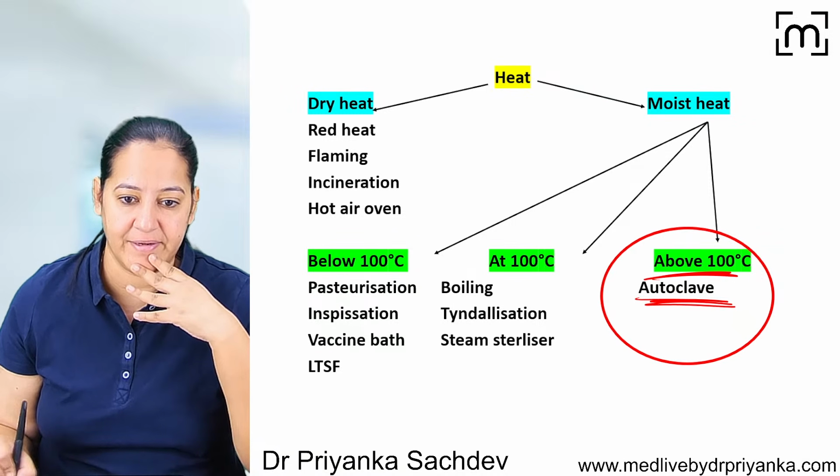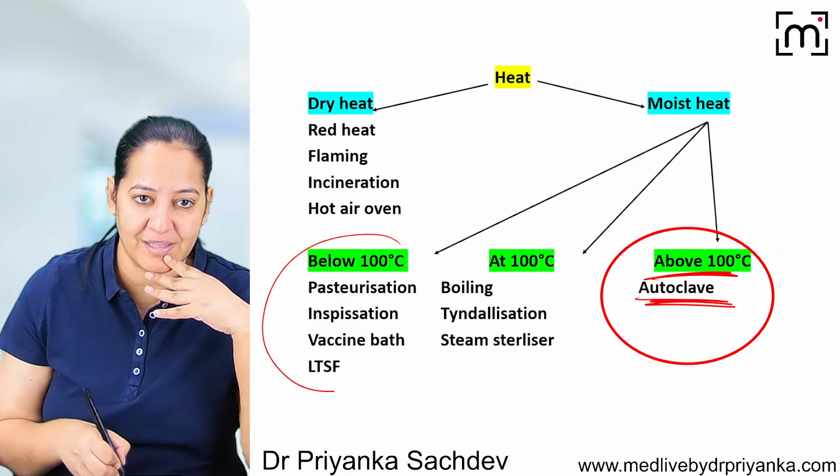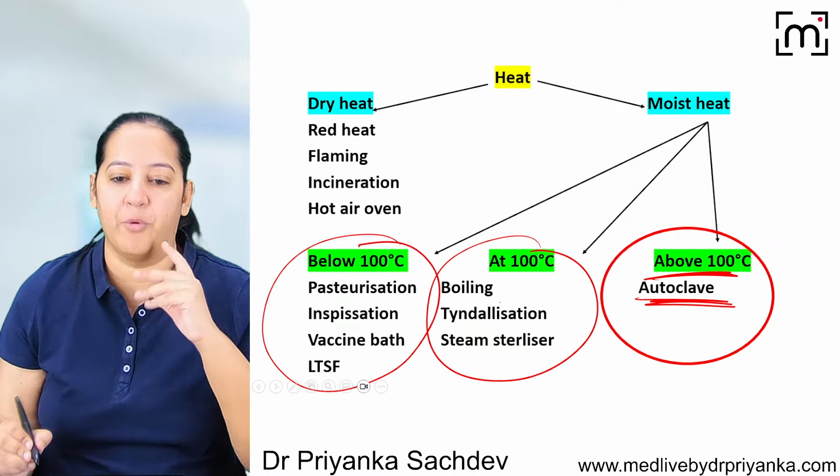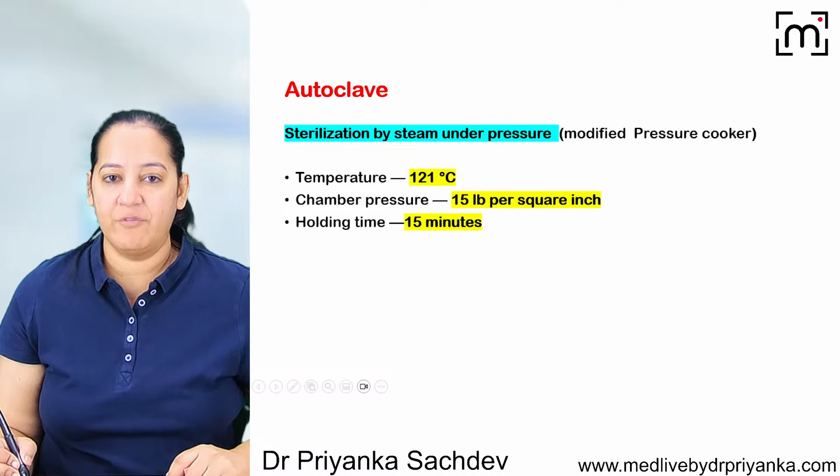You can see it's above 100. These were the 4 methods below 100 degree. These were the 3 methods at 100 degree, and finally above 100. So autoclave. Have you heard about autoclave?